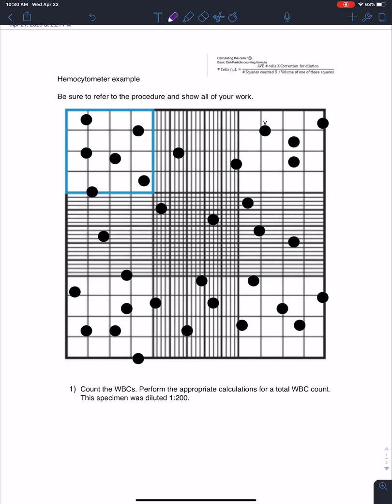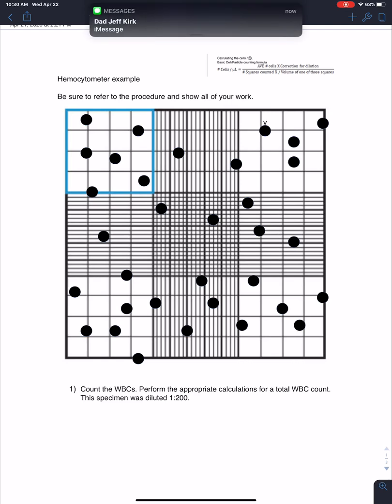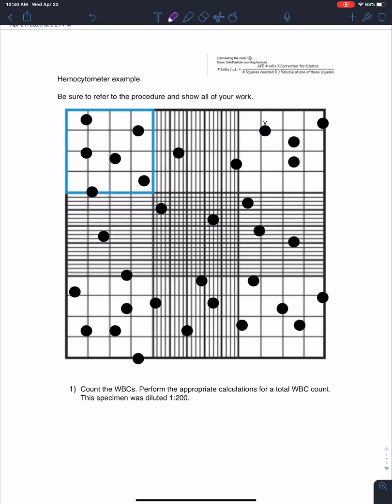Okay, so what we're going to see here is when we start counting, pretending these are white blood cells, so they're larger. Usually it's a little easier to count the larger ones, so we are going to start and count the 4 large squares. Now I'm going to draw, let's try highlighting it so you can see a little better. These are going to be our large squares.